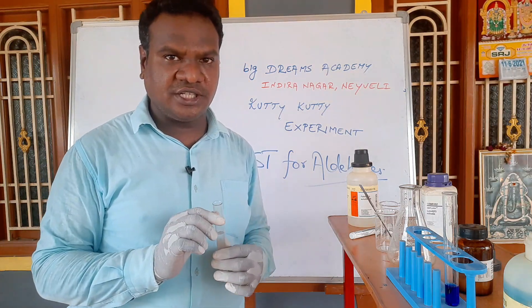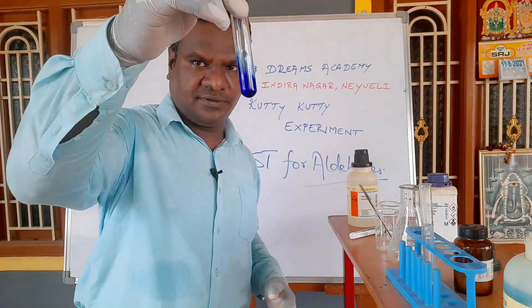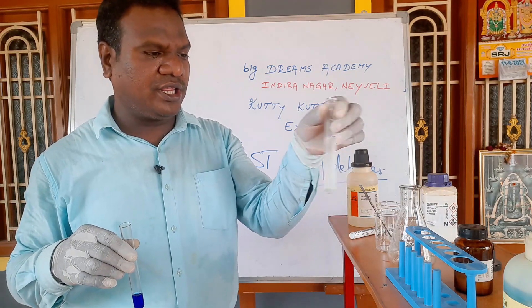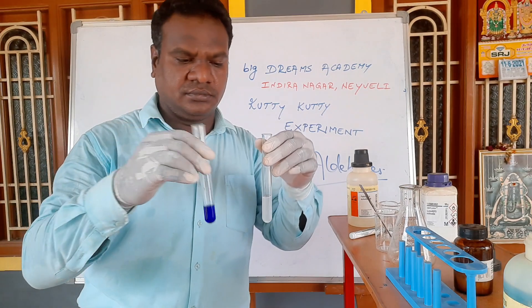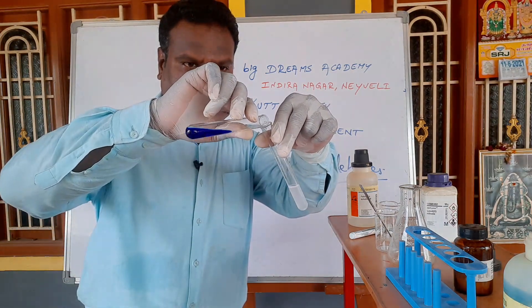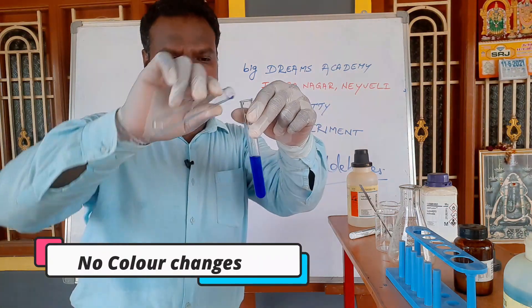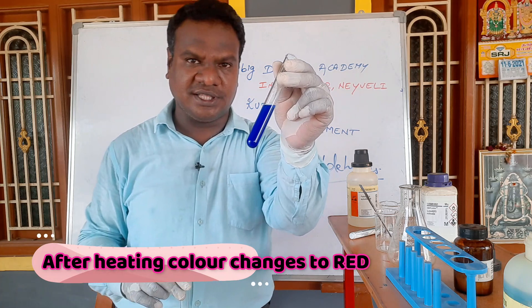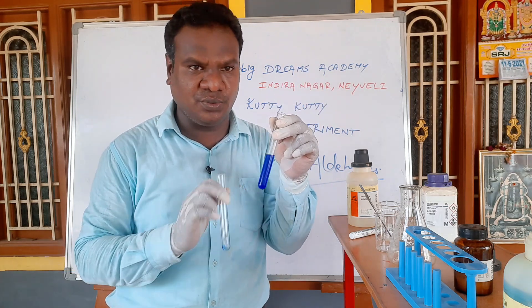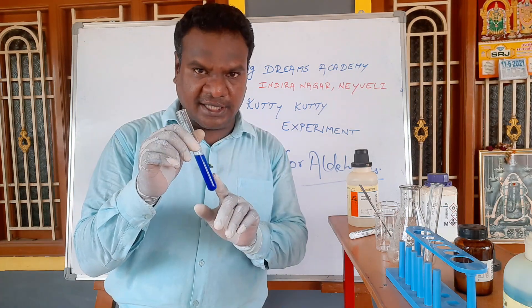The aldehyde is in a neutral solution. Now we add the Fehling solution. The temperature is not enough, so we have to heat this solution. If we heat it in a water bath, the color will change from blue to brick red.